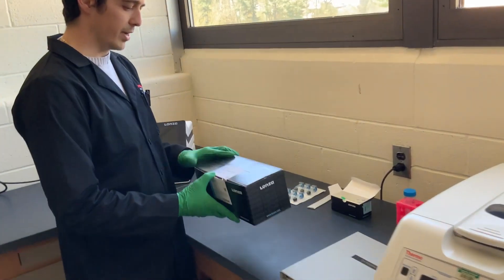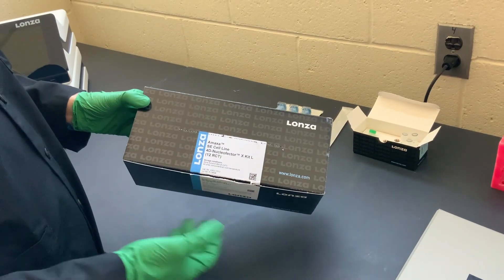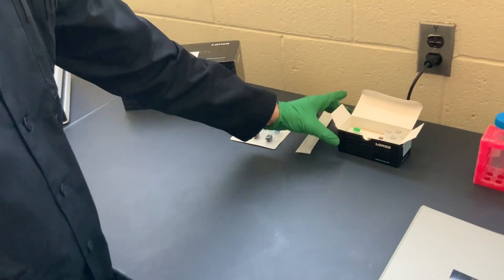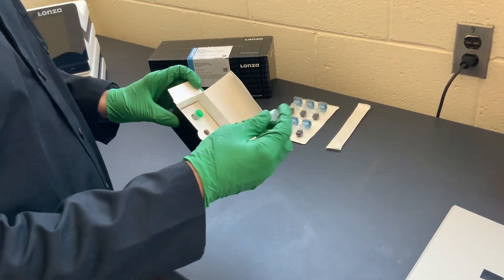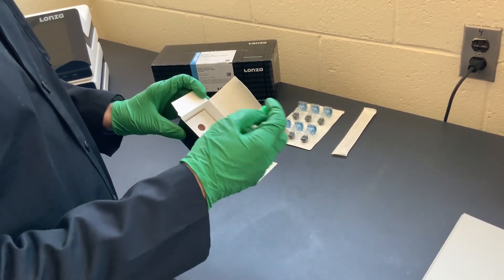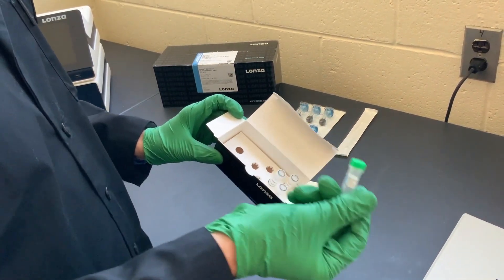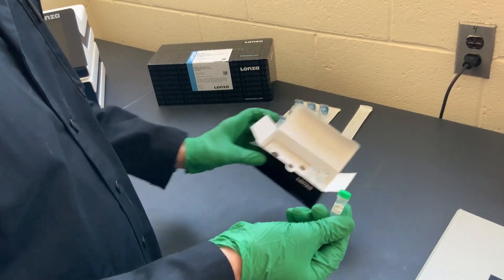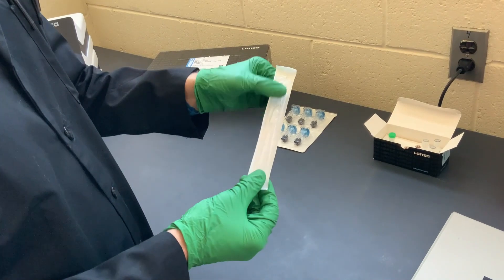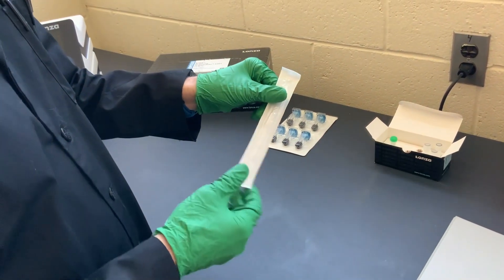So what actually comes in a kit? Here we have the SE Cell Line buffer kit, which is the one we've used here. In this kit you have different solutions of your buffer as well as a GFP control plasmid. You will also need to provide your plasmid of interest when doing the nucleofection. In addition to these components, there are also included sterile micropipettes so you can transfer your cellular components.